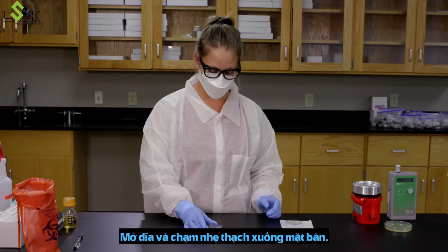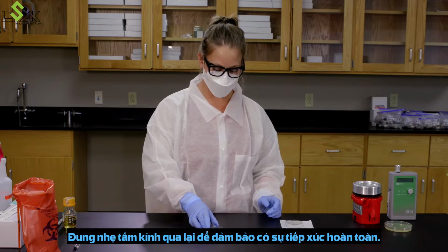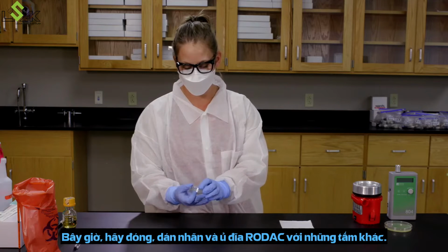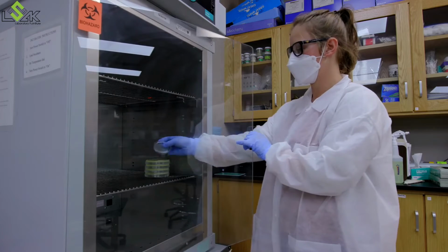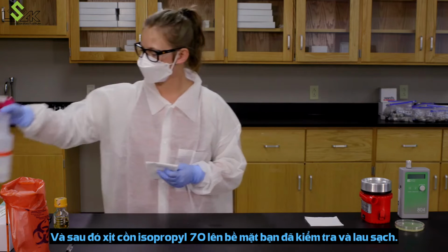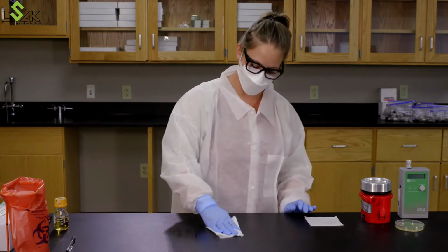Open the plate and gently touch the agar against the table. Slightly rock the plate back and forth to make sure there's complete contact. Now close, label, and incubate the RODAC plate with the others. And then spray the surface you tested with 70% isopropyl alcohol and wipe it clean.